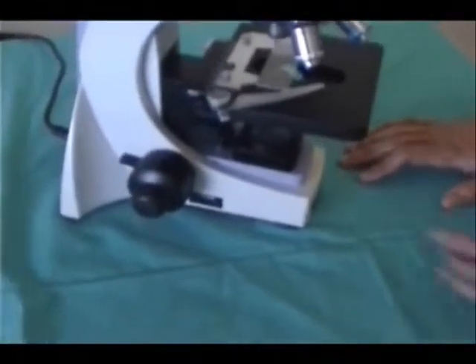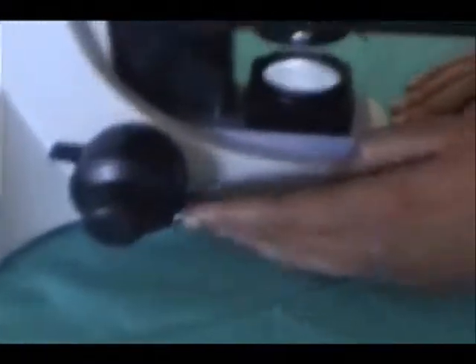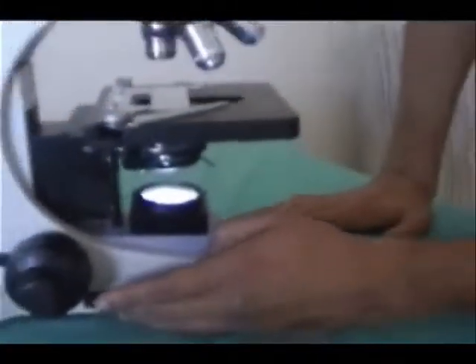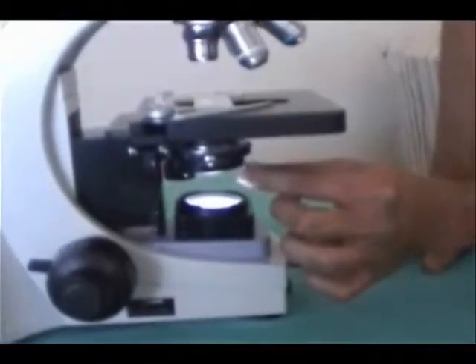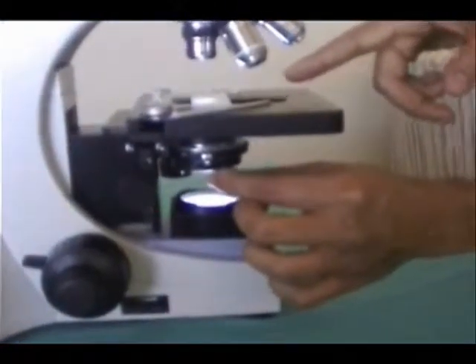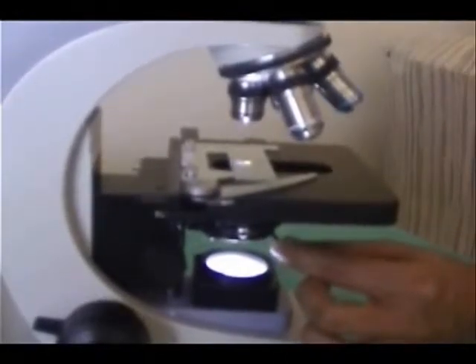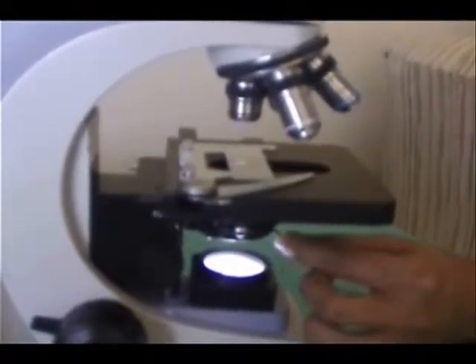Now, the iris on this is adjustable. So the diaphragm actually goes smaller to larger. The specimen will have different volumes of light affecting it depending on how much light you need. This is a great feature and an advanced feature that makes this microscope different from regular microscopes.